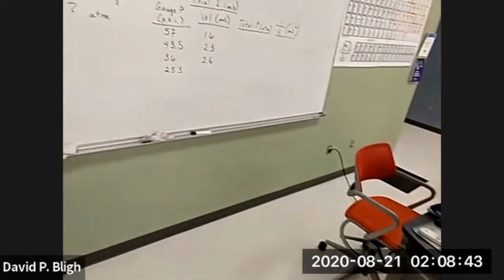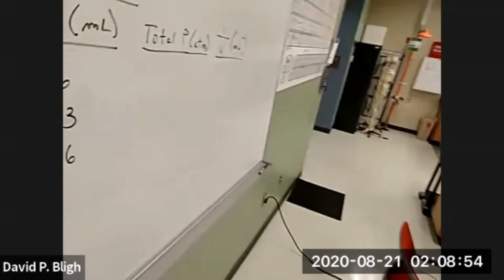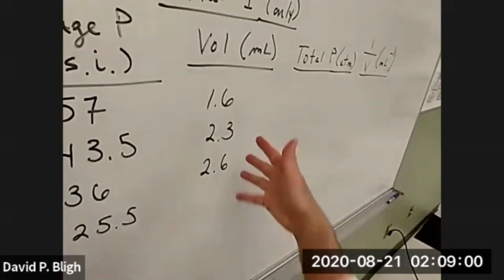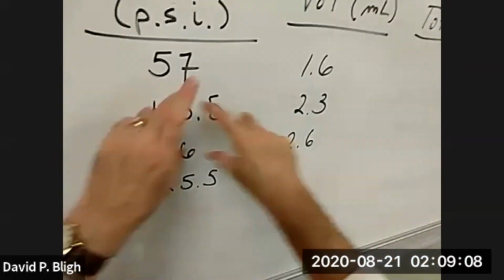Now, what volume is associated with that number? Notice, for those of you who recall your courses in mathematics, these are number pairs, like x, y, that you could graph in a Cartesian system, where you have two axes together. One axis for this one, one axis for that one, and you follow one up, and you follow the other one out, and where they meet, that's your point. So this is a point, a point, another point on our graph. We just need the volume in this case.